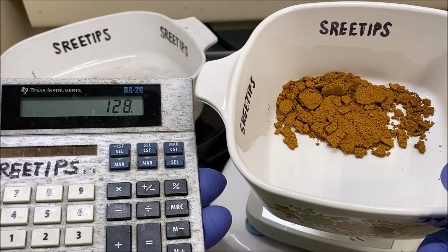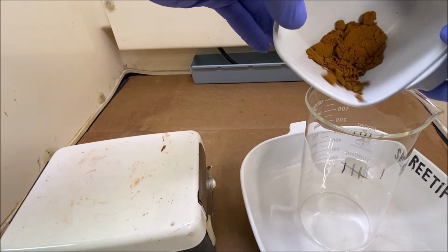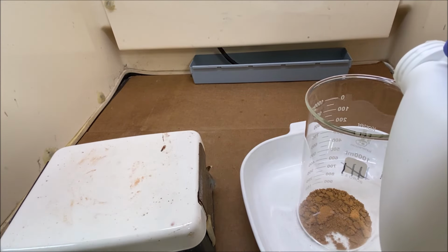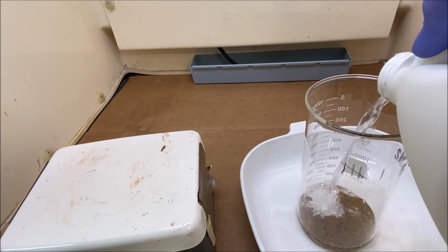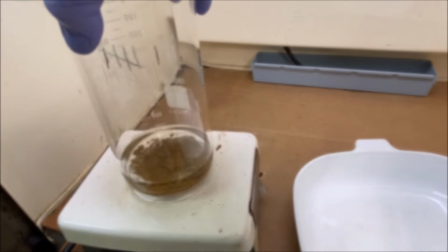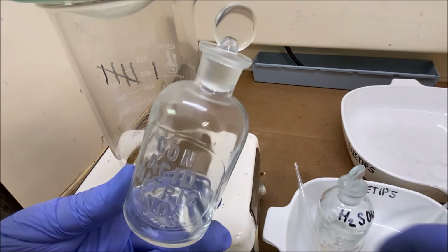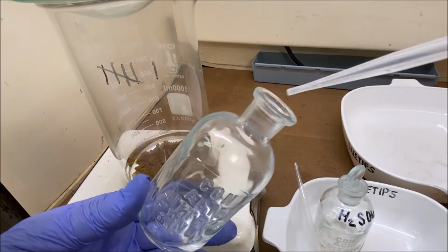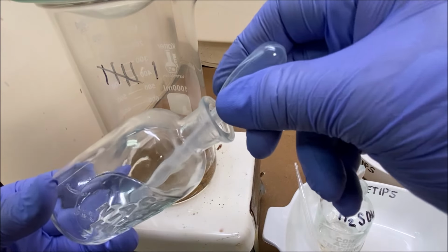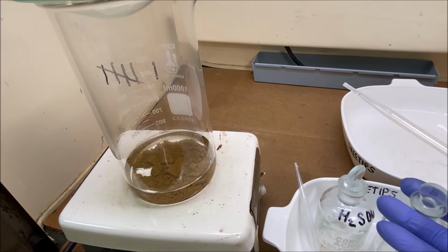So we'll redissolve this now. Let's transfer our pure gold powder into this beaker. And now what we'll do is add about 100 milliliters of hydrochloric acid. Set this up on the heat. Alright, now what we'll do is add a couple of droppers of nitric acid and redissolve the gold. Trying to use minimal nitric acid here to get this gold to go into solution.